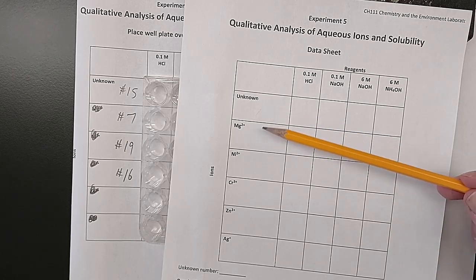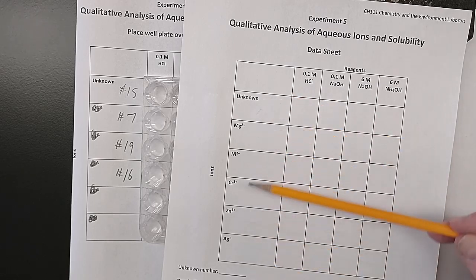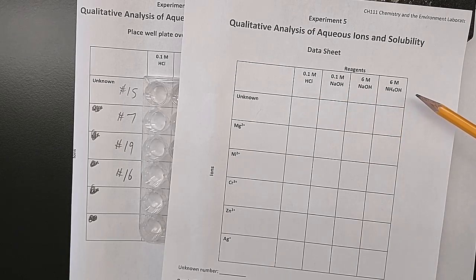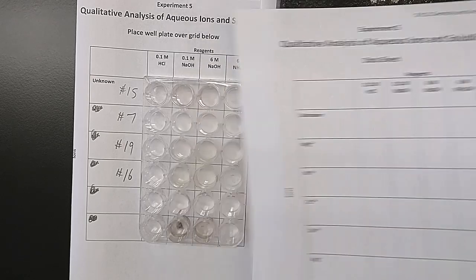All right. We are also going to record what they look like before we add anything to them. Okay? Before we add anything to them, just so that we have a good record of the changes that occur upon mixing these things.